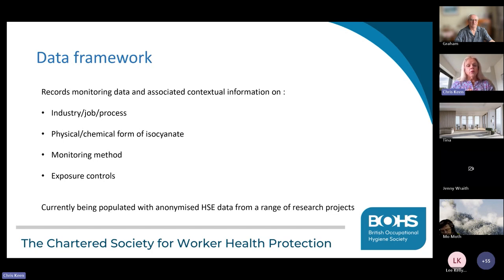That allows us to record the monitoring data and all the associated contextual information that we need to interpret that data. So we'll be asking questions about which industry the data came from, what the job was, what the process was, what the physical form and chemical form of the isocyanate was, the monitoring method used, whether it was an impinger, a filter, or an impinger filter combo, and also about the exposure controls that were in place at the time of the monitoring.